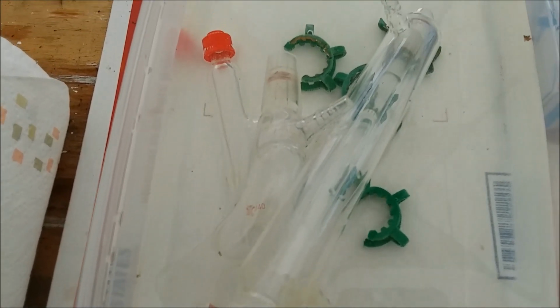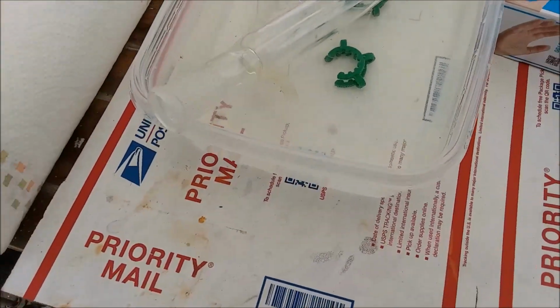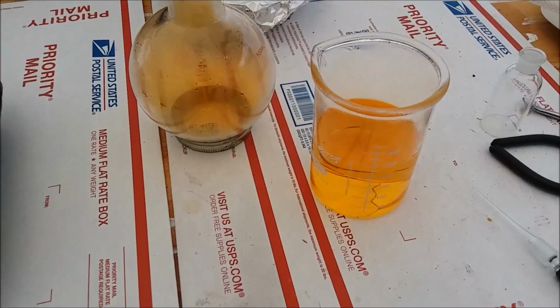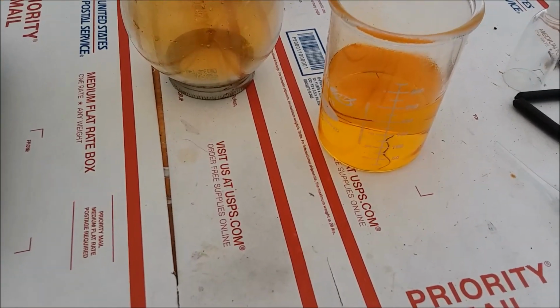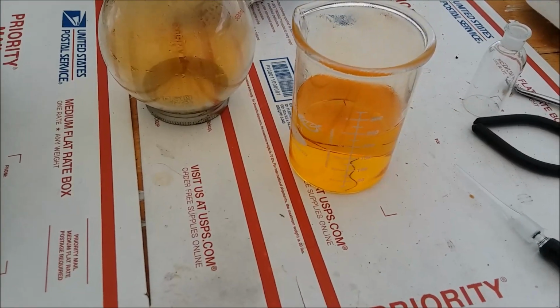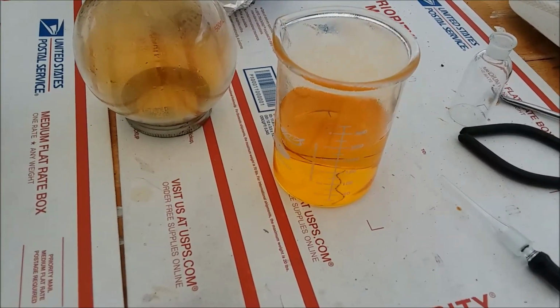A couple of Keck clips are probably ready for the trash, but the rest of them will probably be good for one more distillation at least. But you know, I got more Keck clips. They're cheap. I've got plenty of them. So I'm still making nitric acid cheaper than I can buy it, I'm pretty sure. So this is great. This is a lot of nitric acid too. I've got a project in mind that's going to take a fair amount, I think. So between this and what I've got left over from the last couple of runs, I think I've got enough to do it.